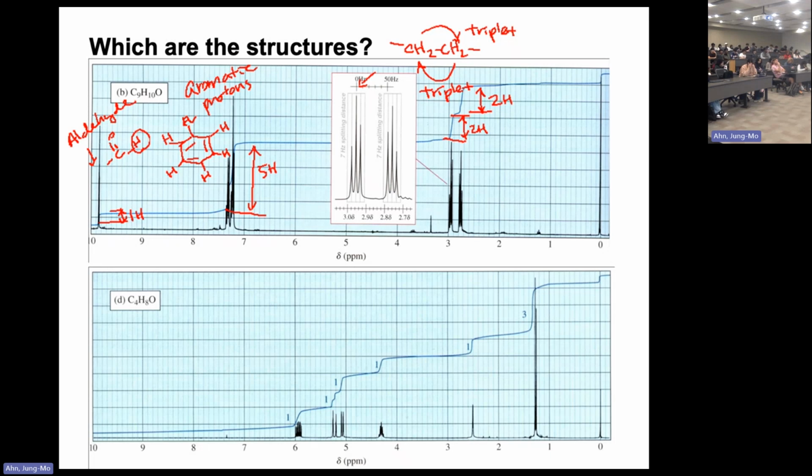That's all the high signal here. And this must be CH2, CH2. So then we can figure out, did we find everything? We were supposed to find 10 hydrogens. There's a 5 here, and then 2 there, 2 there. So we found all 10 hydrogens. So that's all the pieces that we could find from this.